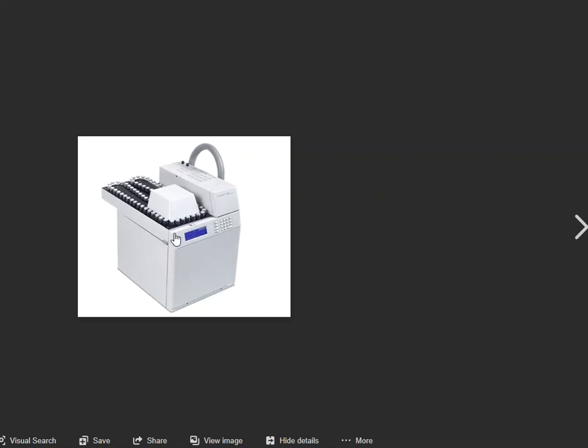This whole lid up here at the very top will open up, and that way you can take a look at the internals of the oven side, and then you just lower it back down like a car hood, and attach it and secure it. That way this can hold at temperature and keep that temperature steady for you over a course of time.